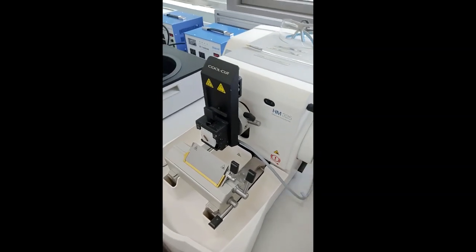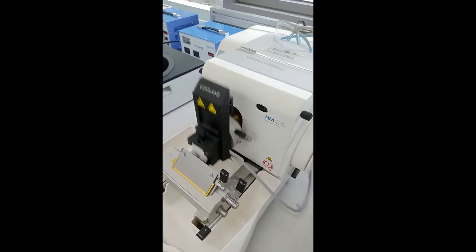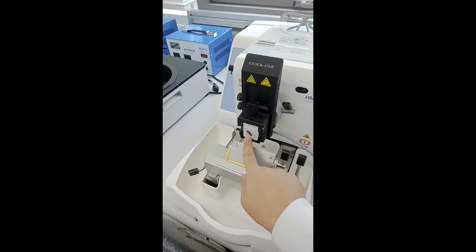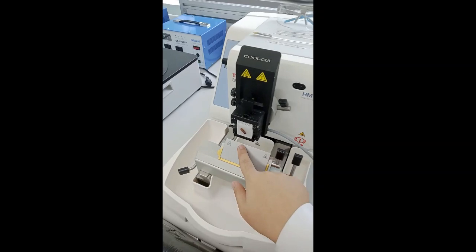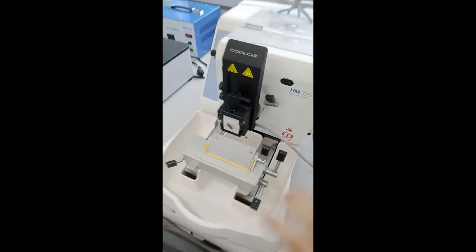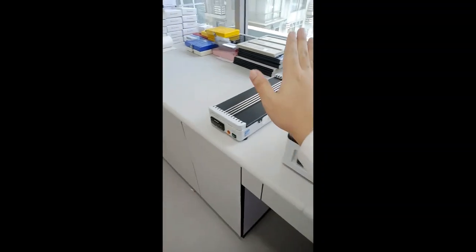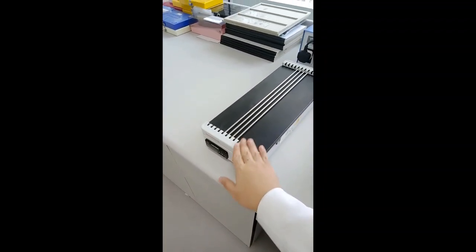The way the microtome moves is it goes up and down, as seen here, so that you can cut these tissues with the blade, which is right here. Once you've got tissue sections and you've floated them in our flotation bath and dried them in our slide dryer, you're ready for staining.